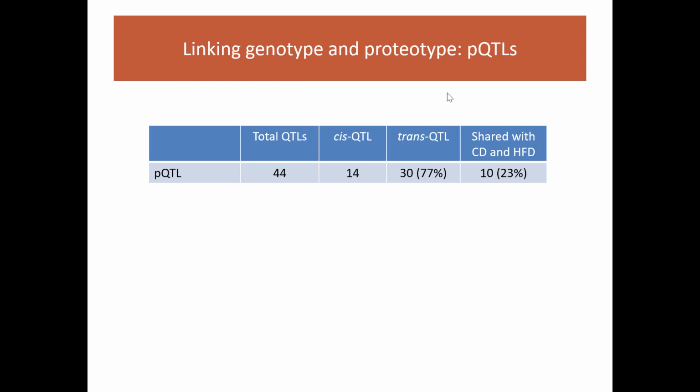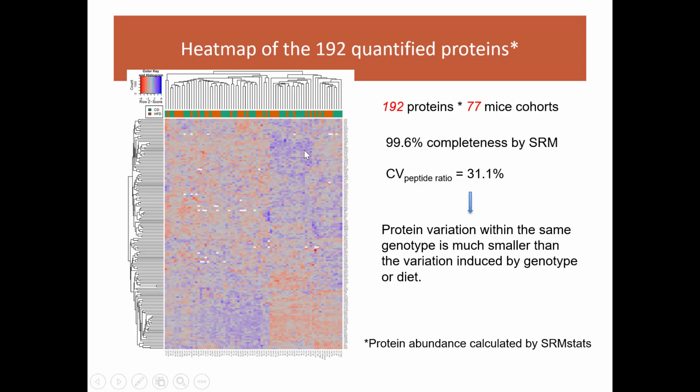So now what we can do with this data set, we can ask, yes? In fact, you're using a ratio, does that mean you have injected reference standards for all peptides, or you have isotope label standards? So this is just based on the integrated peak area of the peptides. What does the ratio mean? Is it label free? It's label free. Okay. So it's basically the intensity, and then it's probably normalized to the mean or something.